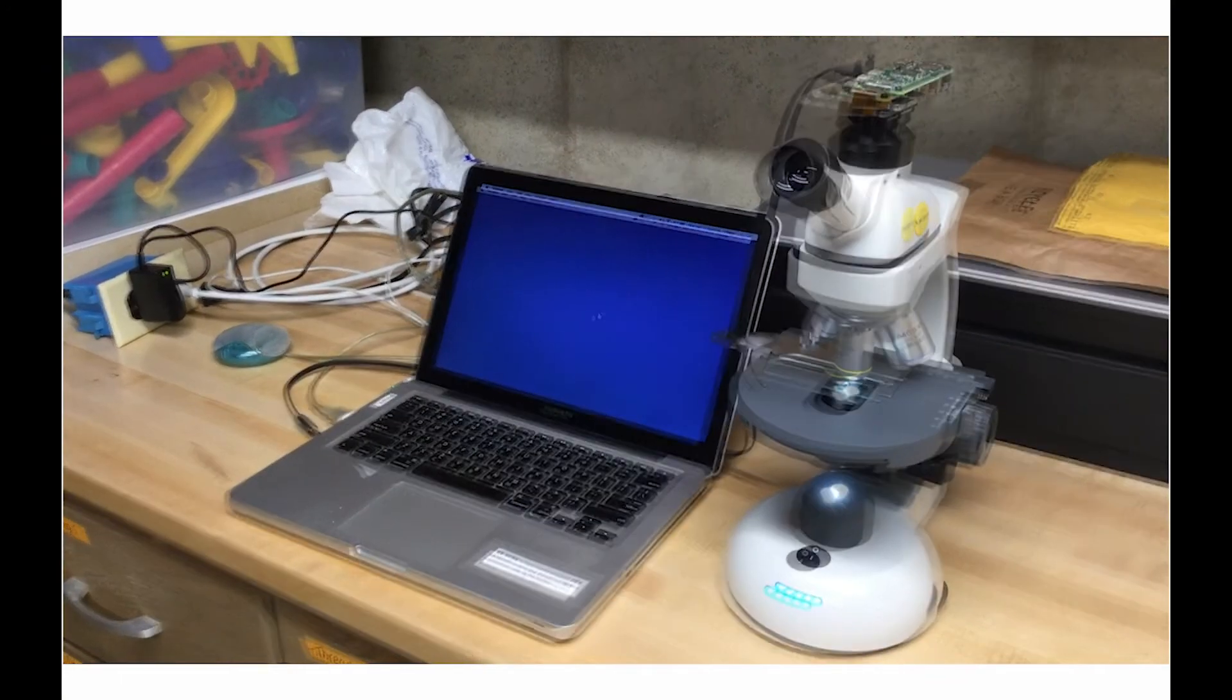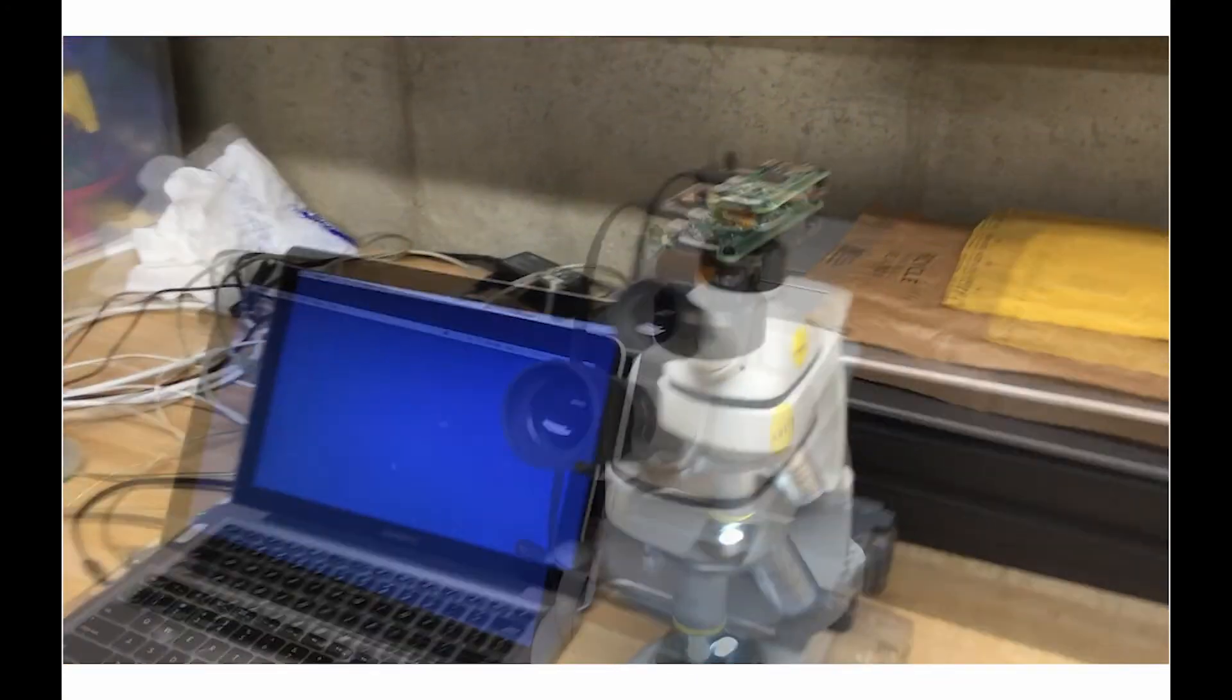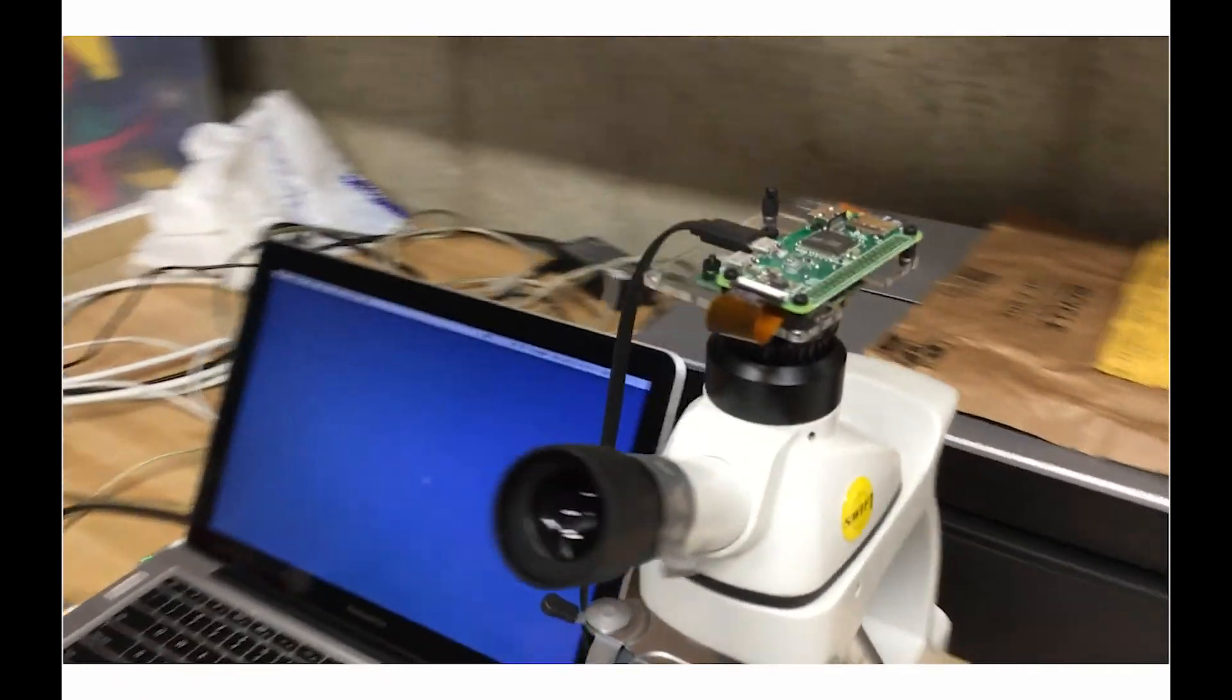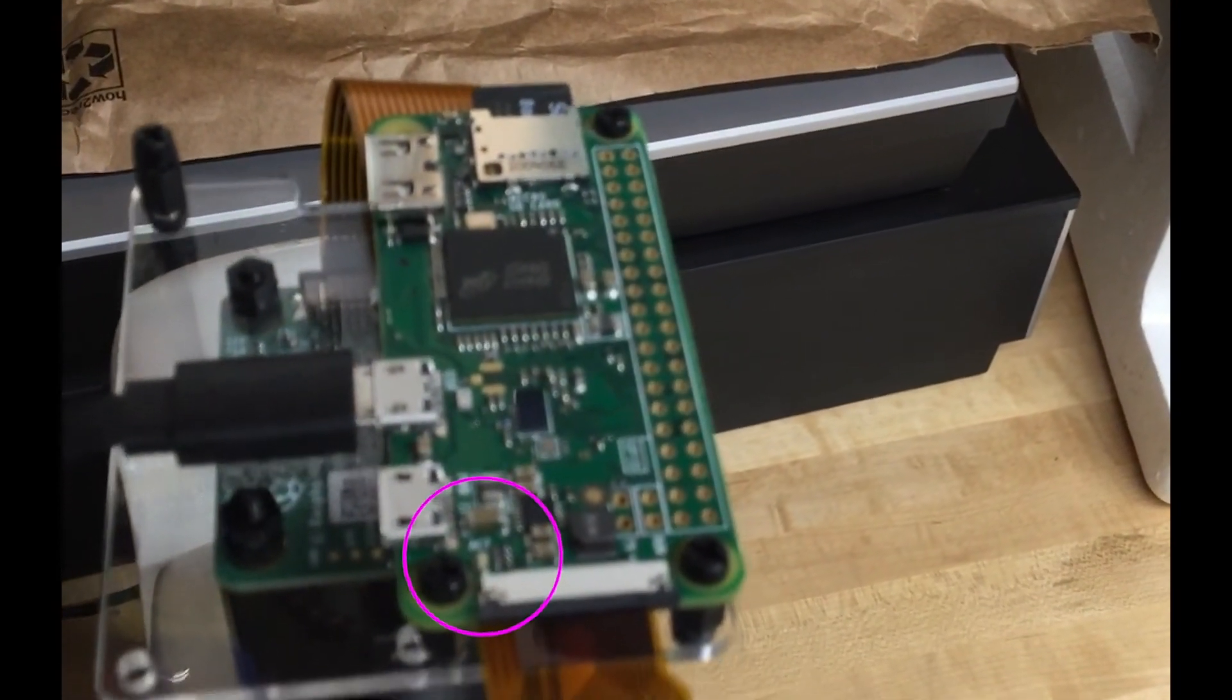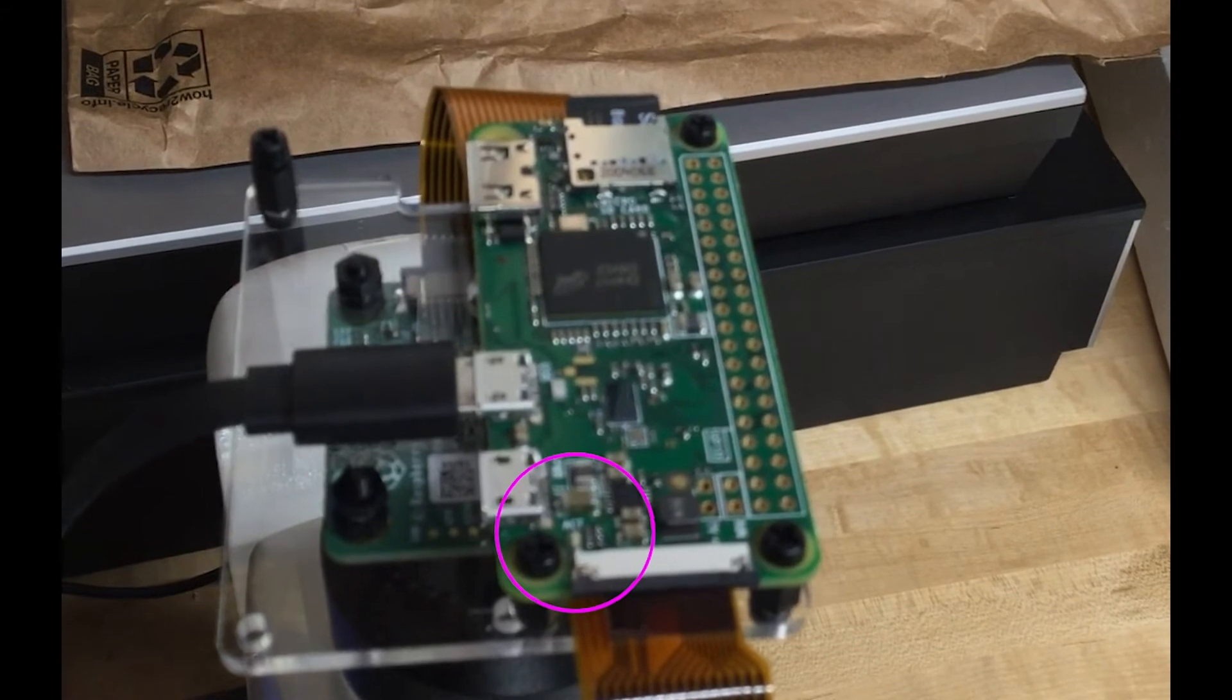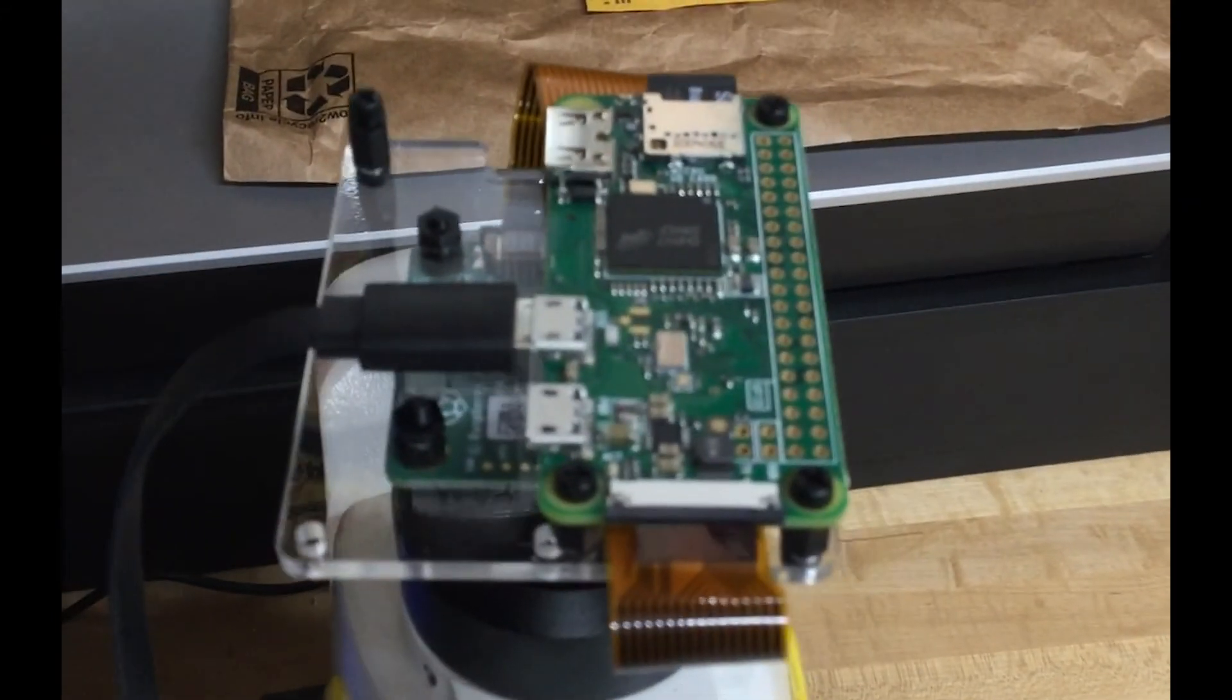Here we have the microscope turned on, the computer turned on, but we do not have the setup connected to the computer yet. We have the cord ready, and now we will plug in the USB connector, and now the system is booting. Initially you get one LED flash, and then you wait for three quick flashes. There they are. And now that camera system is running.